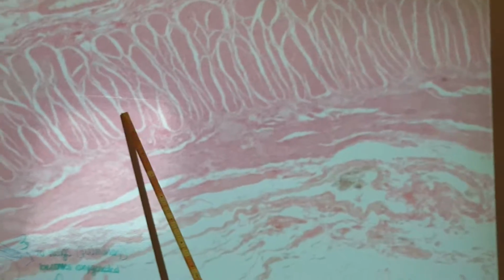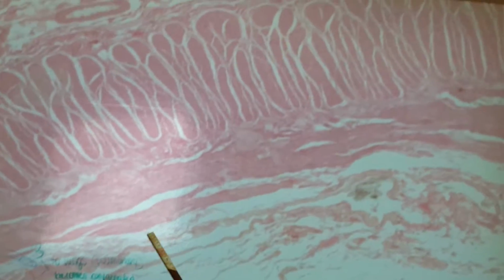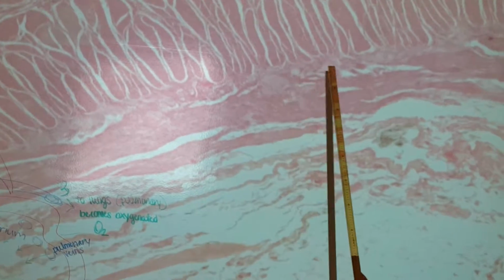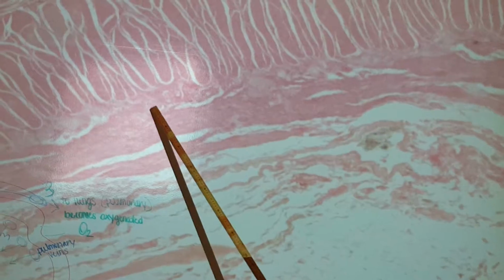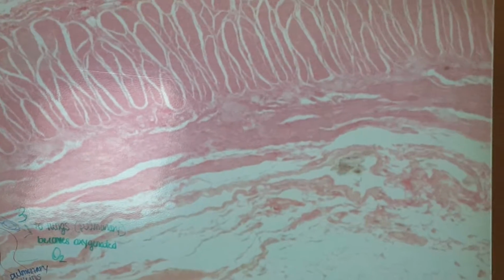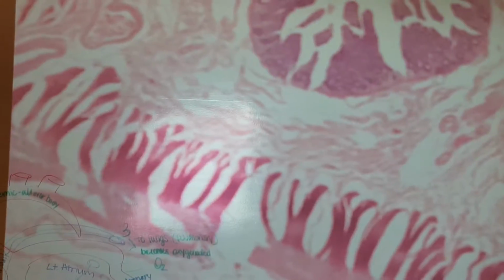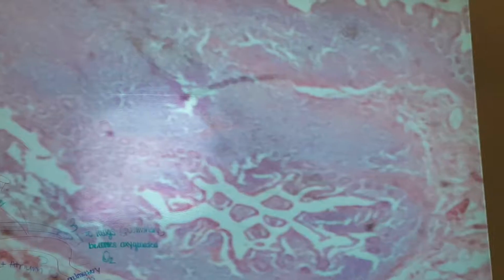I know. It's always circular right after the submucosa. Okay. Yes. But it's always going to be circular after the submucosa. So circular layer, longitudinal layer, and in between we have that ganglion going on. So if you can memorize the order, that would be more helpful, I guess, than trying to figure out what it is.